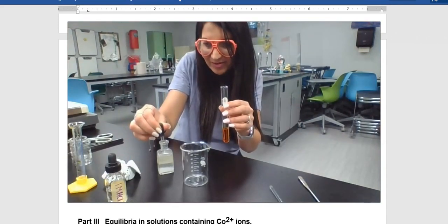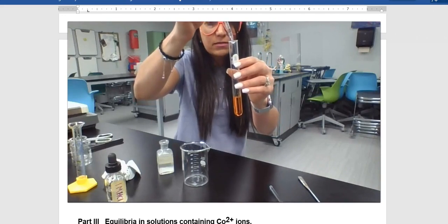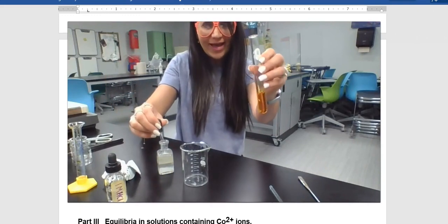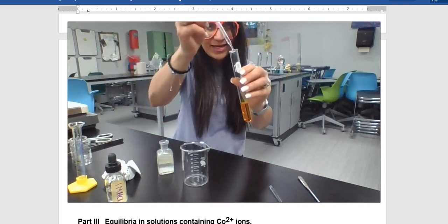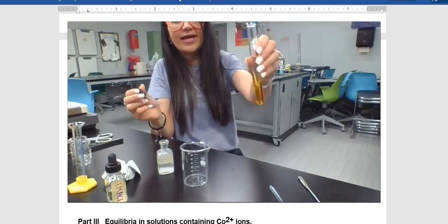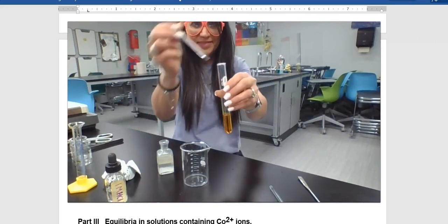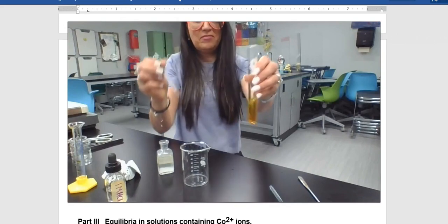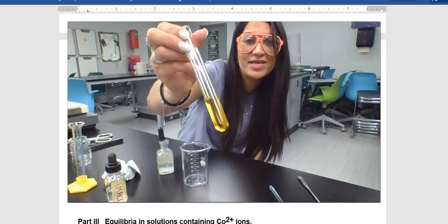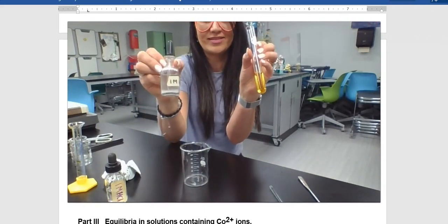We've got the sodium hydroxide here, and some drops. Oh, okay, something's happening. That was about 10 drops. I don't know what you guys think, but that looks pretty yellow to me. So adding the sodium hydroxide got it to go to the yellow color.